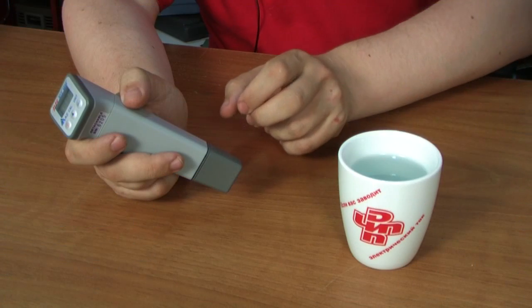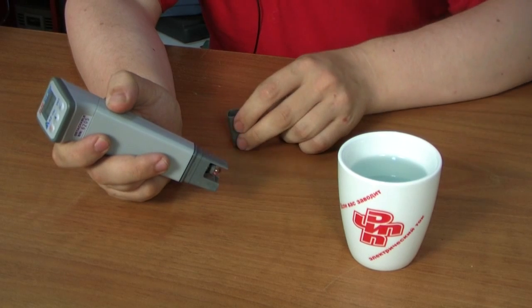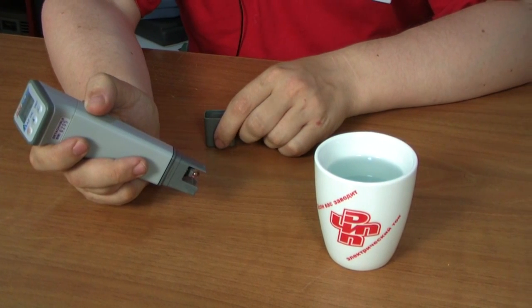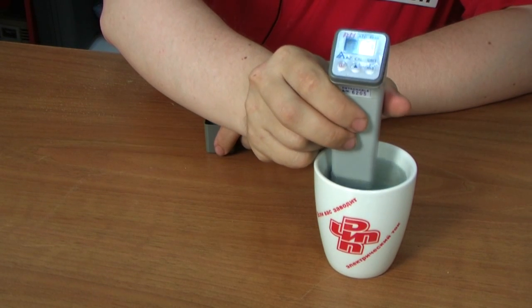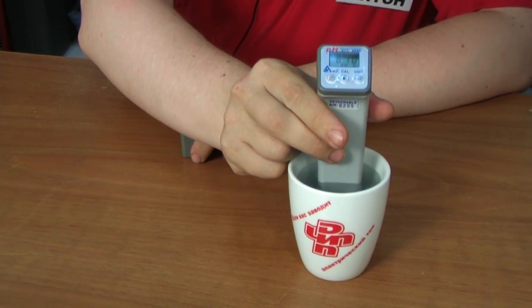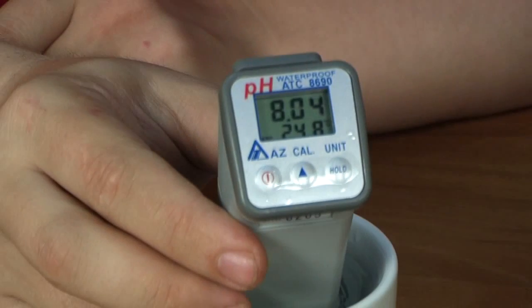Units of temperature measurement, Fahrenheit and Celsius, are displayed on the right. In order to take a measurement, remove the cover from the bottom of the electrode body to expose the probe. Put the probe into the solution under test and keep stirring the device until stable measurements appear on the screen. While measuring, the decimal point on the screen will be blinking.